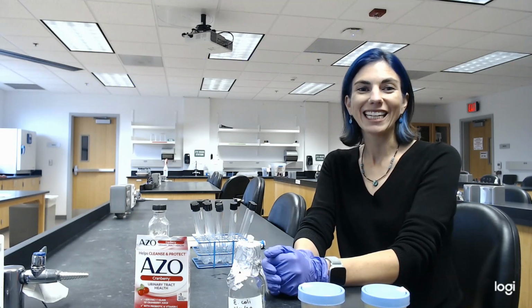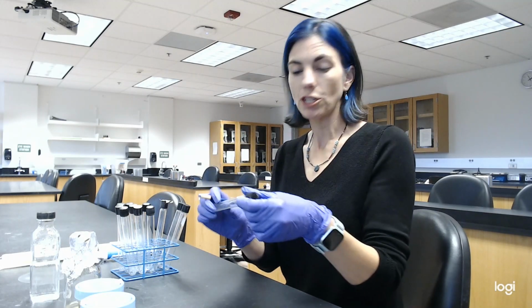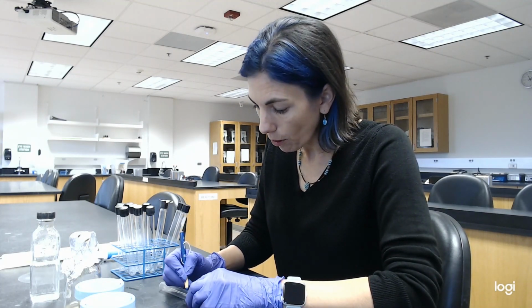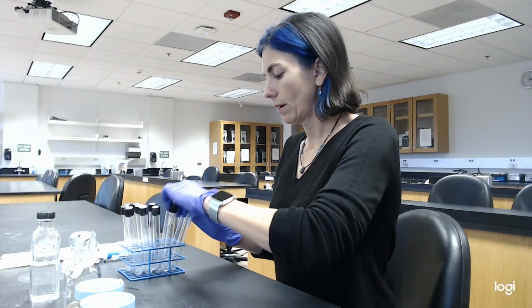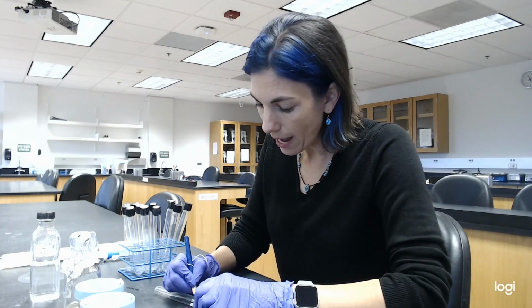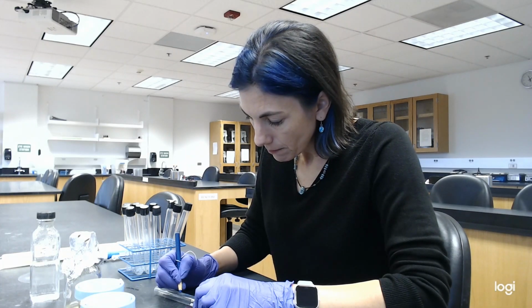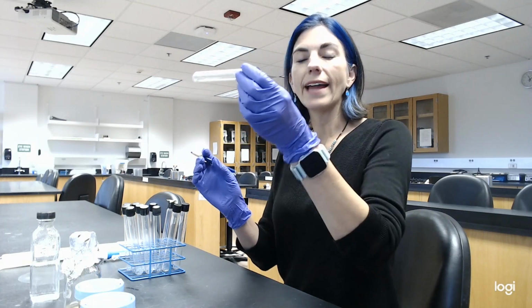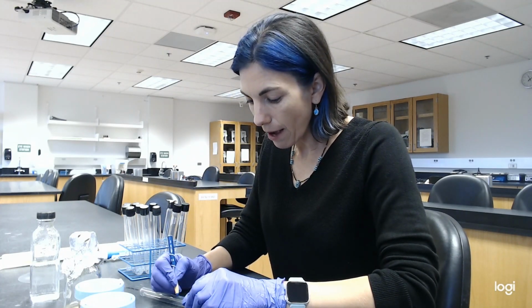All right, let's get started. Okay, so using my wax pencil, I'm going to start by labeling 3 test tubes. I have one that is control, one that is urine prior to taking Azo tabs, and one that is urine after the Azo tabs.